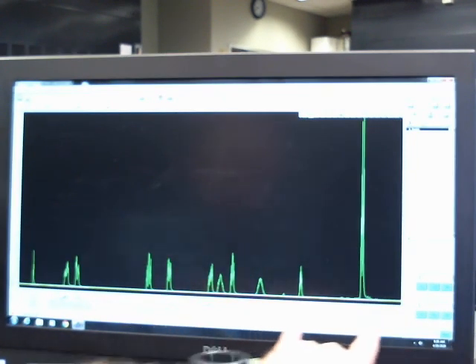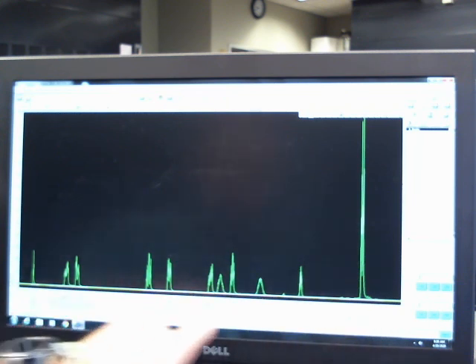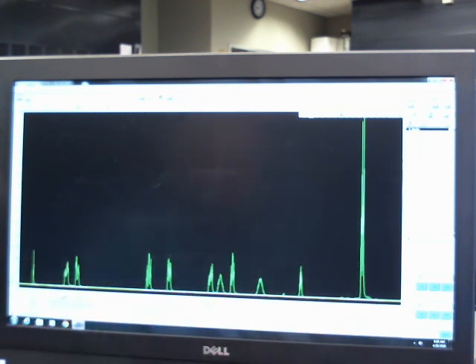And I've already changed the units here on the bottom to hertz, because what we want to do, after building the two possible products on Spartan and getting their energies, which allowed us to see which was the more stable, is look at the dihedrals. Remember, we measured those because by geometry they correspond through the Karplus equation to a certain predicted J value. So we were able to predict J values for the two possible isomers using the Karplus equation.